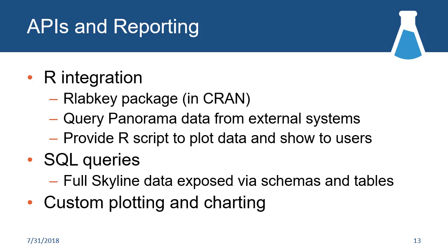So anytime you're looking at data in Panorama, you can click on a button to say export an R script. It's going to give you within R the same data that you're looking at inside Panorama. And we've got similar options for Perl and Python and other languages if you're not doing R yourself.